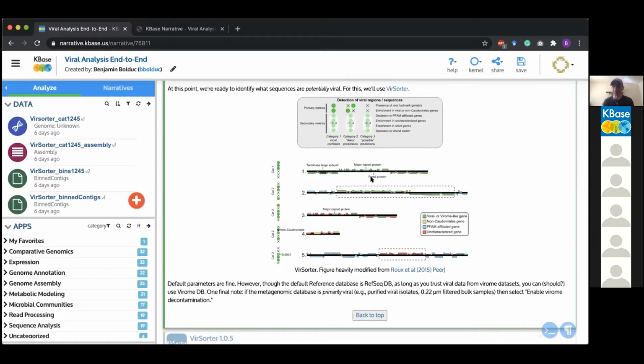Portal proteins are also characteristic of viruses. As for strandedness, you basically have one or two strand switches here. It's not uncommon for viruses to use the same strand for all of its coding regions. And yeah, so category 2, you might not have as clear-cut a case.